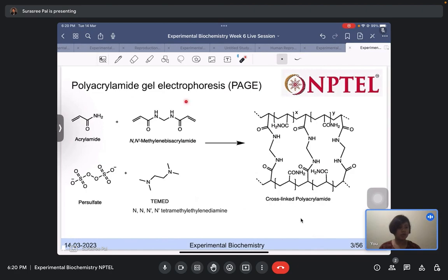Now what is the role of bisacrylamide? Acrylamide can form linear polymers, but bisacrylamide is basically two acrylamide molecules.